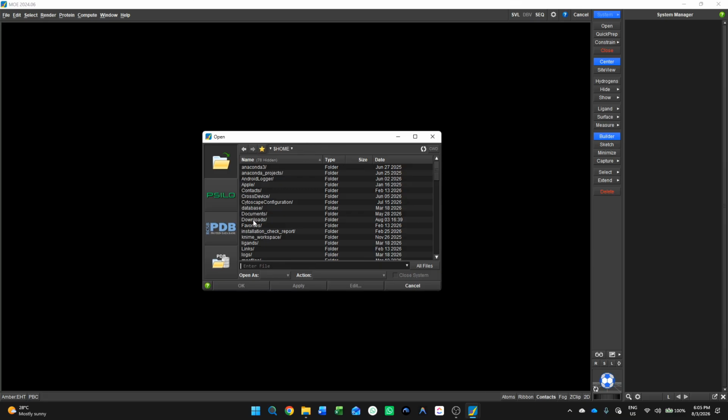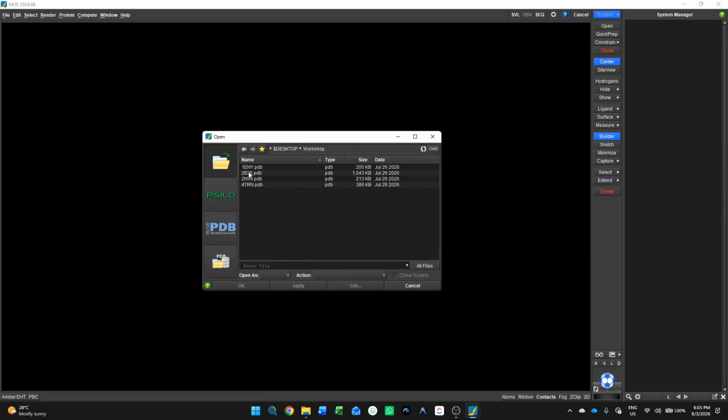So now we are going to get to our working directory. Our working directory is different. Okay, that should be my desktop. I change working directory to my working directory.